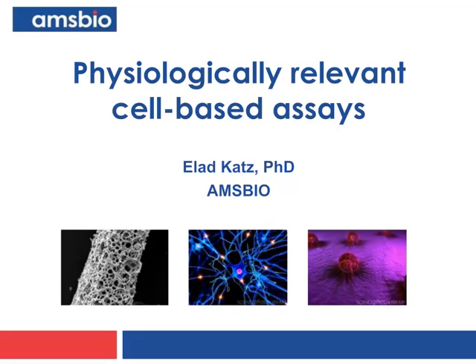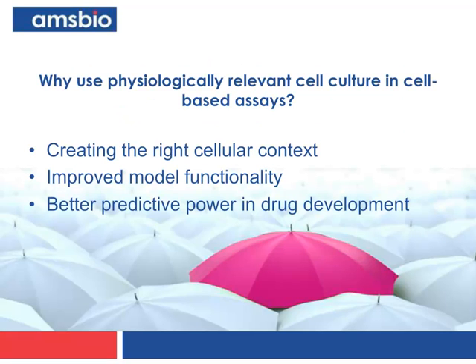Thank you, Rob. I will speak today about how to introduce physiological context into the way that we do cell-based assays, especially in drug discovery. Physiologically relevant cell culture is a fairly new concept based on what we typically shorthand as 3D culture. The principles of that concept are three.